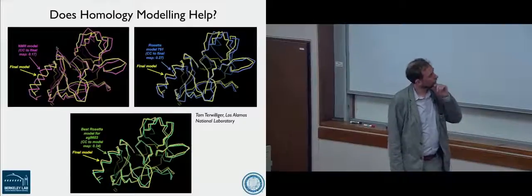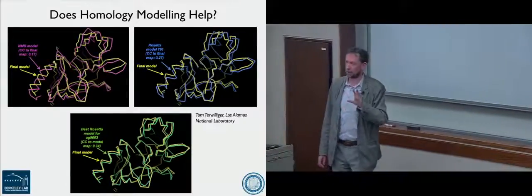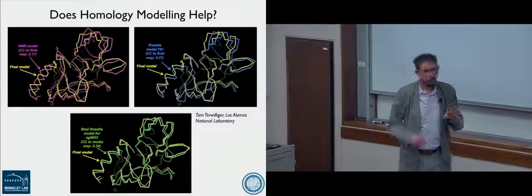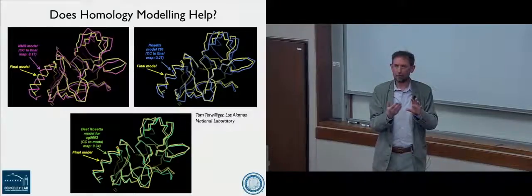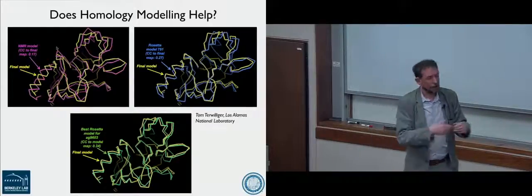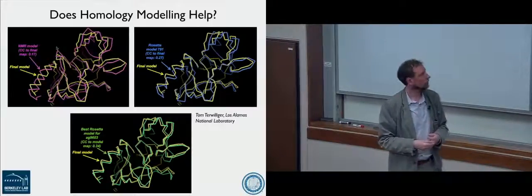And what you do is you take that purple model and the current electron density map, which is very, very poor, and give that to Rosetta and say, give me models that you've tried to make better that are also consistent with that density map. One of the fundamental ideas here is that there is something useful in that map. It's not totally random. We just can't see it and figure it out for ourselves. And you get it to make a few models, because there's some stochastic random component to this.